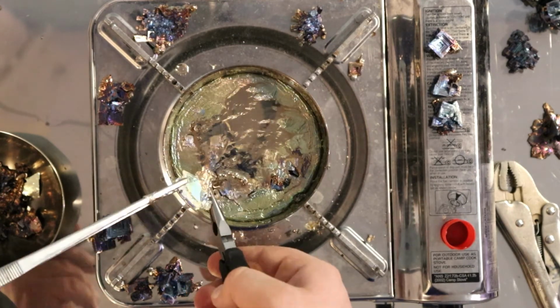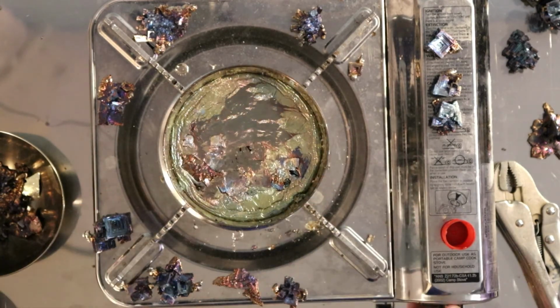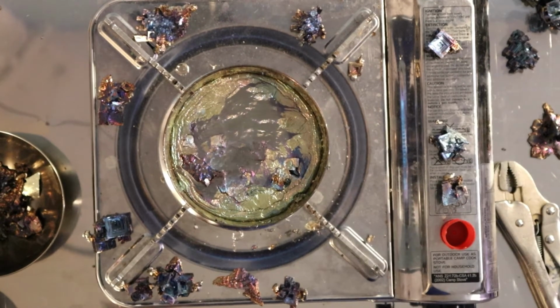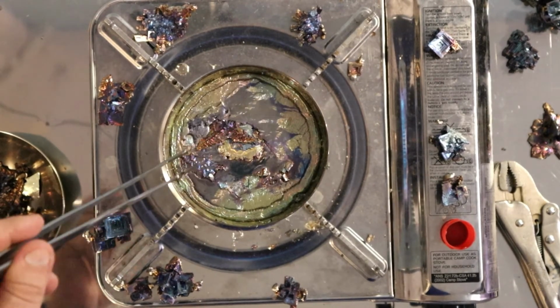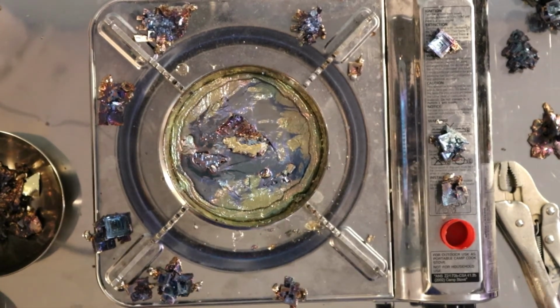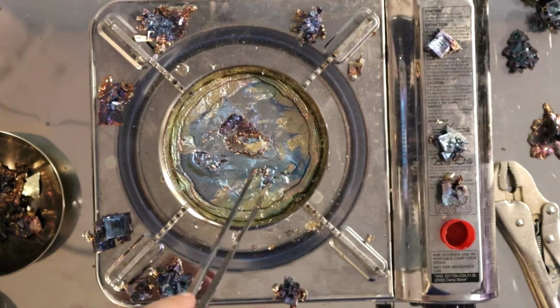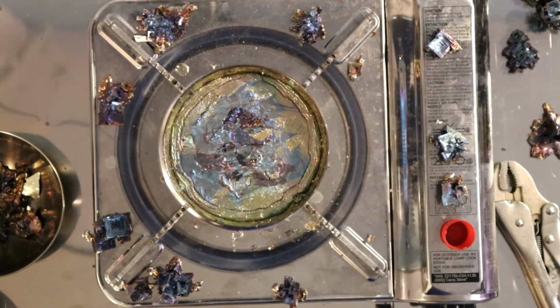We will remelt, and this time I'm going to try putting one of the crystals in before it's fully molten, or before I turn the heat off. Make sure that the oxide gets off of it before trying to remelt like that, or before letting it cool. And I'll probably, let's see, where did I just put the one with the copper on it, I think I maybe put it back here. And if the copper wire floats up, that will just be obvious, I guess.